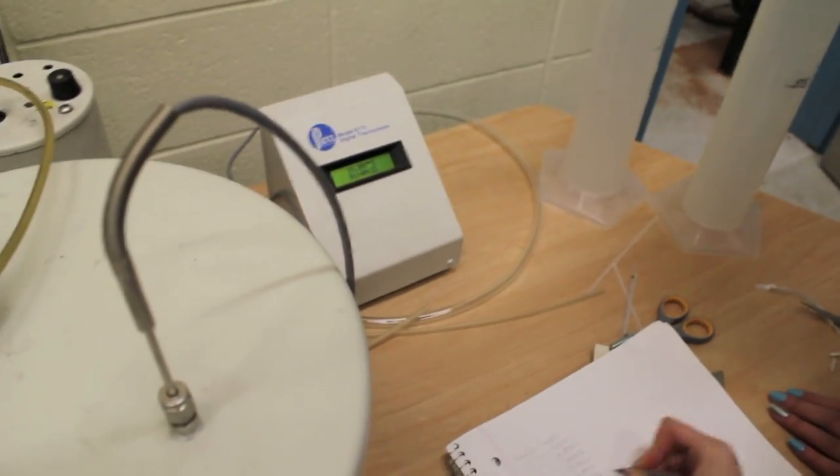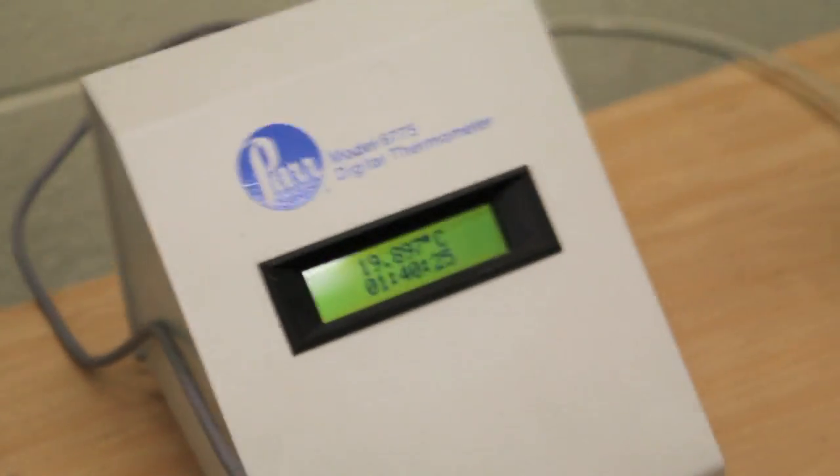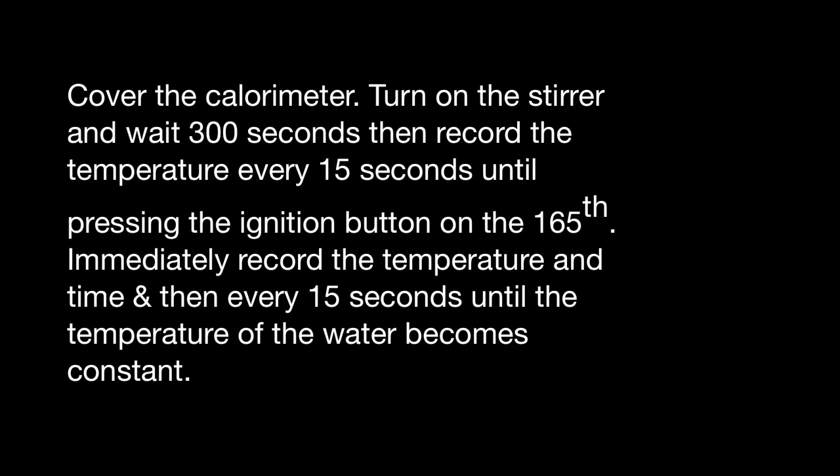We are recording the data before detonation, waiting for the temperature to stabilize. Cover the calorimeter. Turn on the stirrer and wait 300 seconds, then record the temperature every 15 seconds until pressing the ignition button on the 165th second. Immediately record the temperature and time, and then every 15 seconds until the temperature of the water becomes constant.